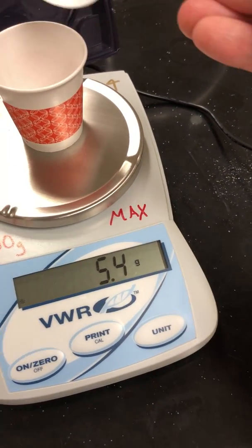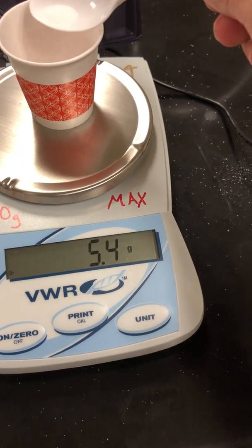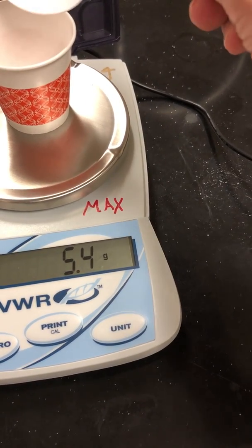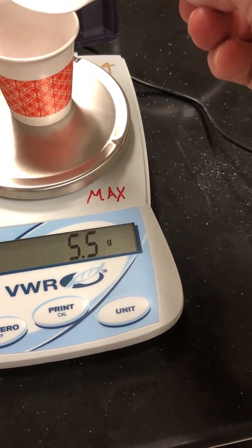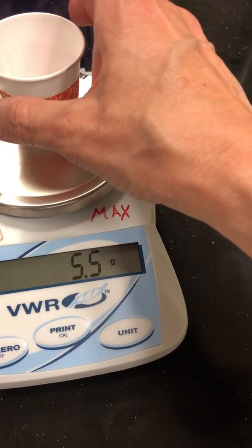That really could be okay because that last digit, guys, is uncertain. But I'm gonna try. Oh, come on, come on. Nice, because you know, precision always feels better.